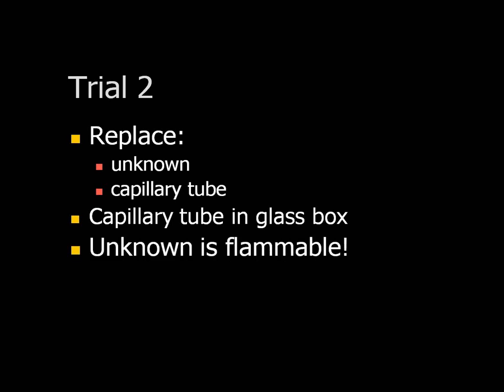Bear in mind that when you're working, all of the unknowns you're working with are flammable, so just keep that in mind when you're working with an open flame. The vials that the unknowns are in should have the cap on them unless you're taking something out. All right, this ends how to find your boiling point.